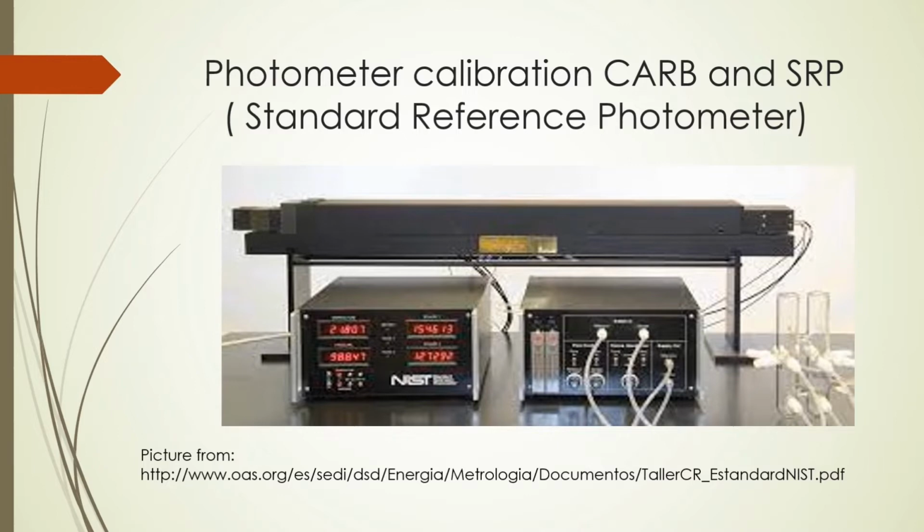The standard reference photometer comes into play since ozone is very unstable and it is not a gas you can store up in a bottle, but rather have to generate on the spot by filtering a UV lamp at 185 nanometers. The standard labs complete comparisons against higher level standard, and a certification report is created with a true ozone calculation, which is required to correct your values displayed on the transfer standard itself.